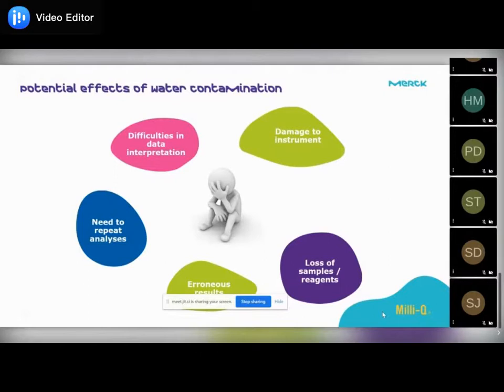Today, we are working with microliter or nanoliter sample sizes. If you lose that sample, what will be the consequences? Here, I'd like to highlight one thing. Just imagine, for whoever is currently doing COVID testing, if you are collecting a sample from a patient and diagnosing whether this patient is COVID positive or negative, and you lose that particular sample, can you go and ask that patient, I want to take your samples once again? The patient will not allow you. It is a question of your credibility. Even if you are working in research, it's a question of your research also.